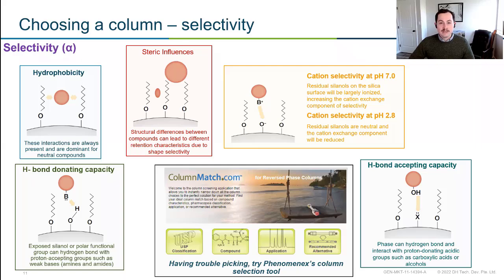So this can be, and admittedly it was for me when I first started, one of the more tricky parts of LC analysis, choosing the column that's right for your method. So there are a lot of really cool tools out. I particularly like this one from Phenomenex called Column Match, not just because it has a funny name, but you can actually enter in the structures of the compounds you're interested in, and it will give you suggestions on what stationary phase might be best for that type of analysis.